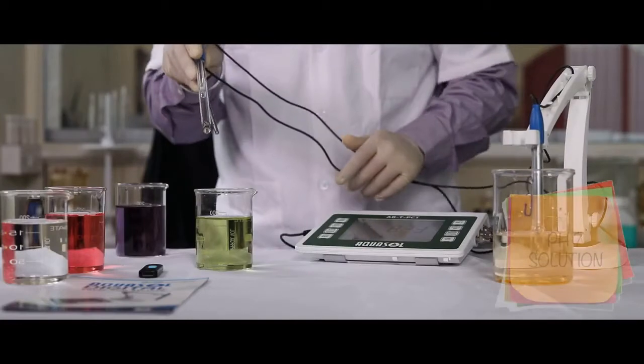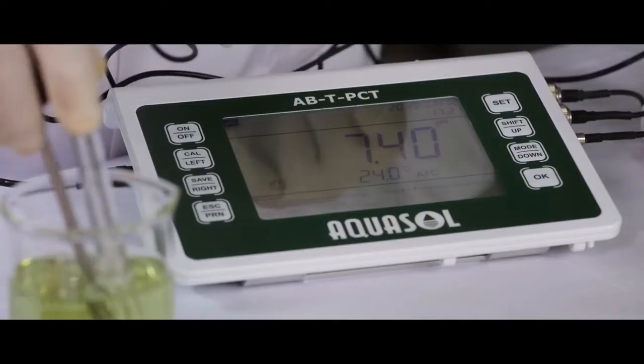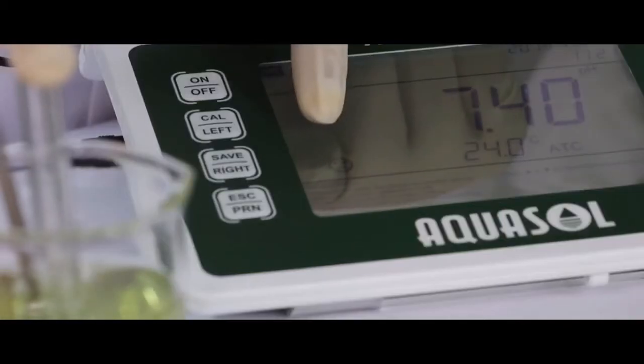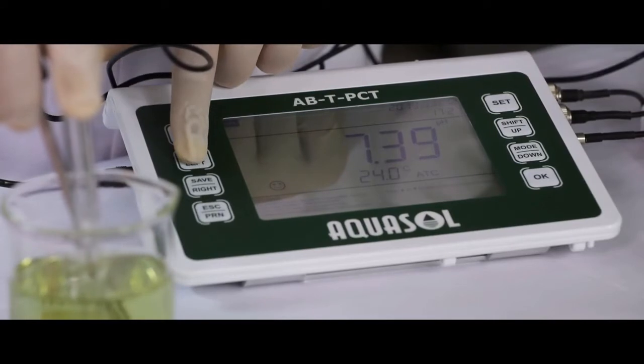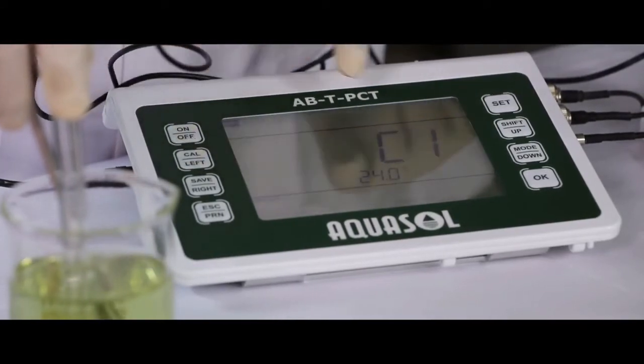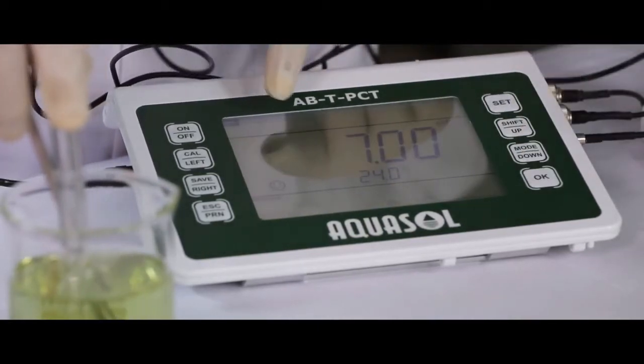For calibration of pH, dip the pH electrode in the standard pH 7 solution. Once the reading stabilizes, a smiley emoji will appear on the display. Now press the CAL key to calibrate. C1 indicates the pH 7 solution. Press OK to continue.